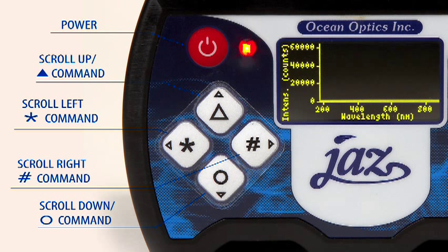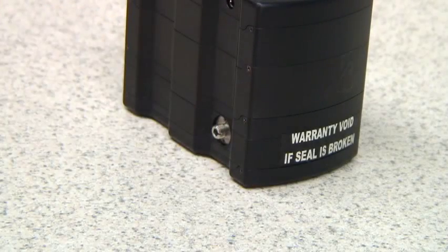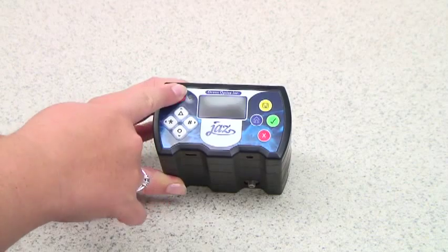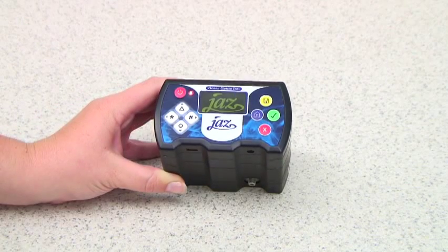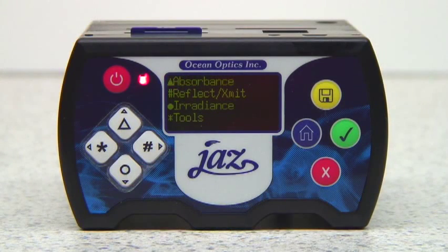The white buttons are used to navigate through screen displays and to select options. Before we take any measurements, remove the cap from the spectrometer to allow light to enter. Now we are ready to turn on JAZZ — it will take a few seconds to power up. The home screen on your JAZZ will show the following measurement wizard options: absorbance, reflectance and transmittance, irradiance, and tools.